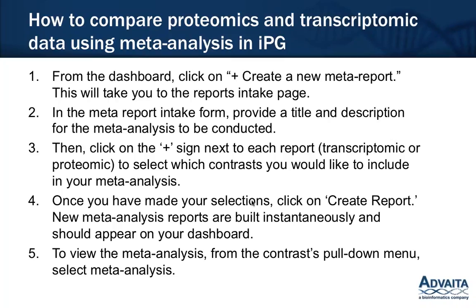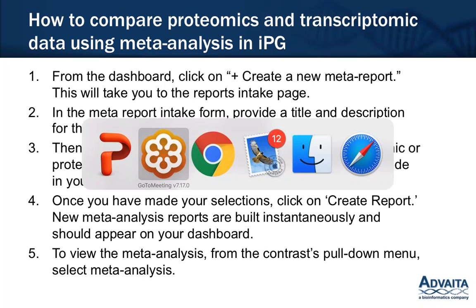So next I'm going to show you how you can generate the meta-analysis report. As I said earlier, we have gone through how you can analyze a single contrast in iPathway Guide, and proteomic contrasts are analyzed the exact same way as transcriptomic data. So I'm not going to show you that, but I'll show you how we can create a new meta report in which you can compare the protein and the mRNA expression data. I have listed the steps here on how you can do this, but I'm going to show this to you within the application.